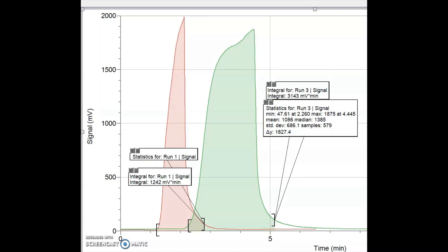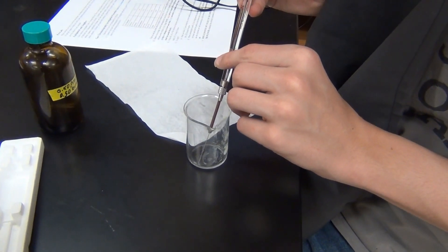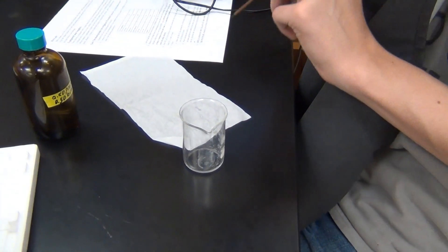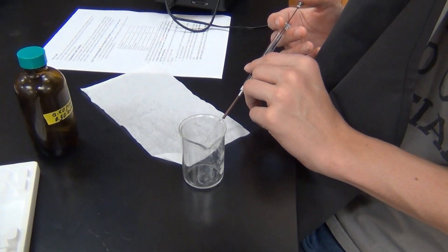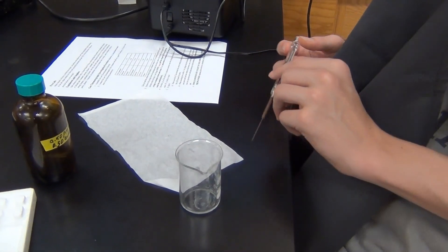It does appear that the butanol molecules have a wider spread of time impacting the detector, where the propanol molecules all impacted the detector in a shorter amount of time — a narrower, sharper peak for n-propanol than for the green n-butanol peak. This is a mixture of n-propanol and n-butanol that we're going to use for the last experiment.